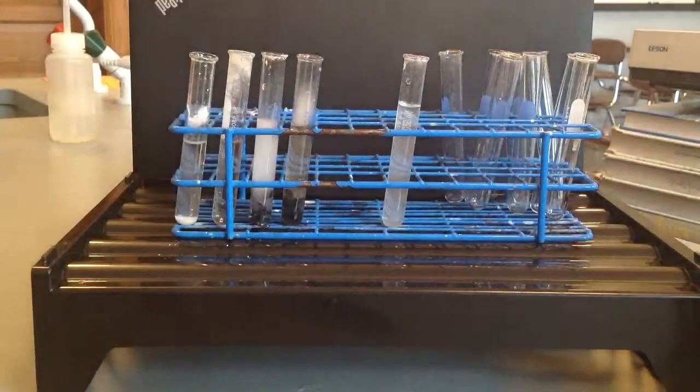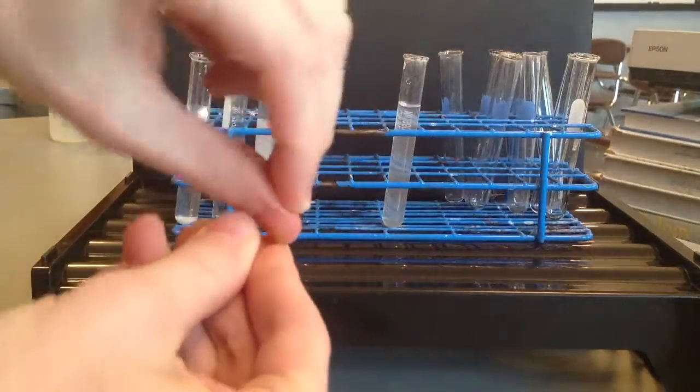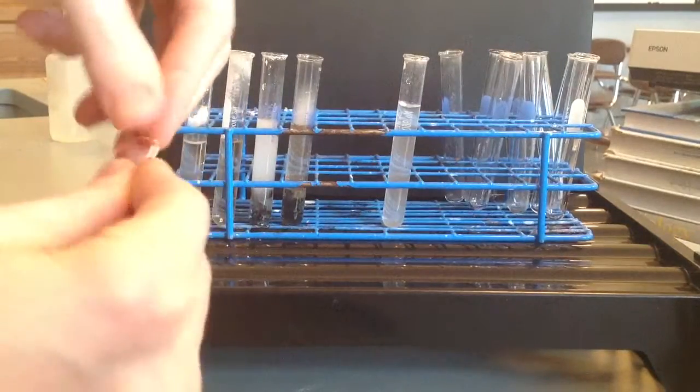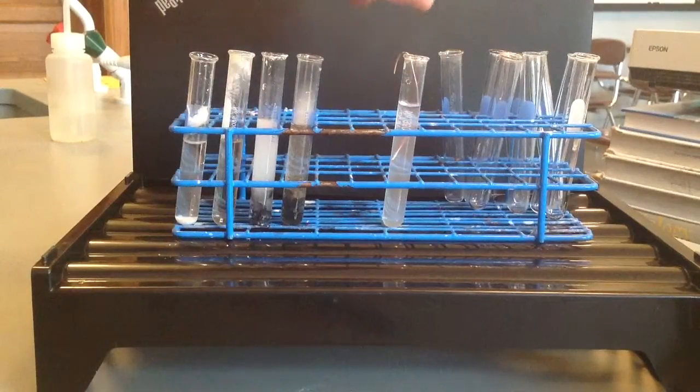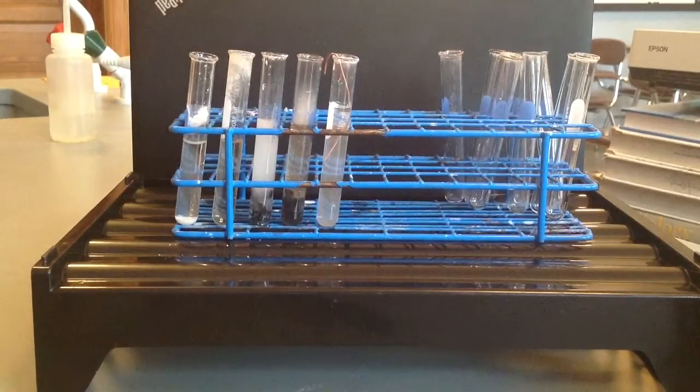And so what I'm going to do now is take our copper wire and put it in there. So copper wire, make a little hook, and there you go. I'm going to move it over to right there, and we're going to let it sit for 15 minutes. You can go ahead and make your initial observations based on what you see, and then we'll come back and make observations as we go along.